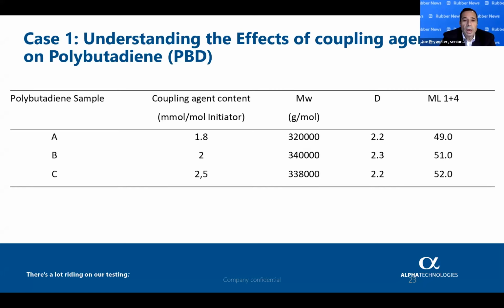Okay, great. Another question here. Could we use LAOS to evaluate the variation in mixing using the same polymer? For the mixing, of course, branching has an influence, as we mentioned several times. For the mixing, we created another test method that was not shown in the presentation.